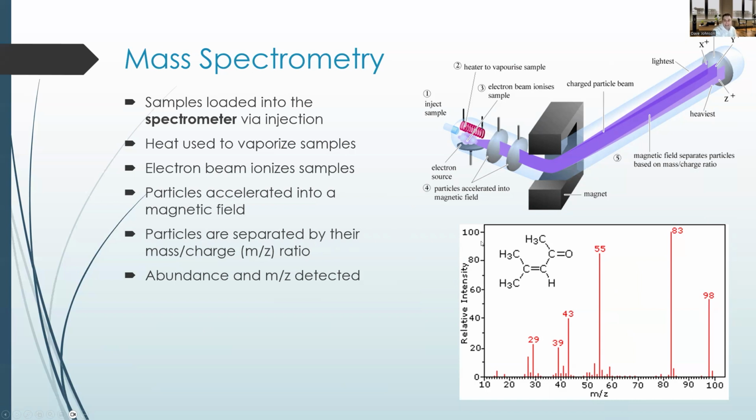All right. And again, to do this, this is one of those things where you need to have preloaded samples. You need to know what this pattern is going to look like. So this is what the pattern looks like for this particular molecule. I actually don't know what molecule that is. So if you're looking for this molecule in your sample, you need to look for this particular pattern when you go through the mass spec, and then you can compare relative abundances by comparing this condition A to condition B.